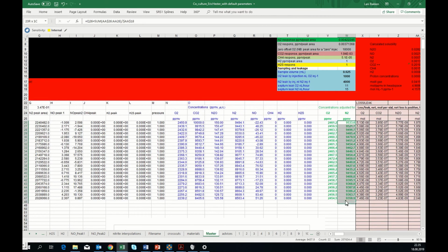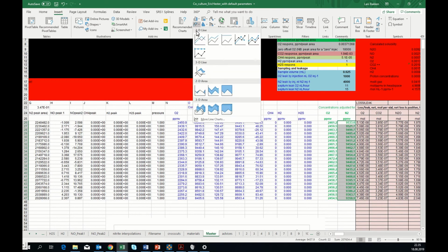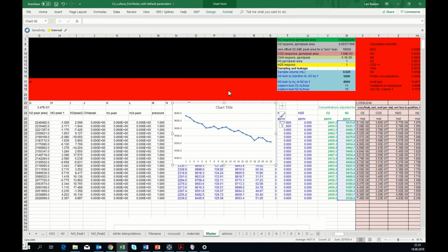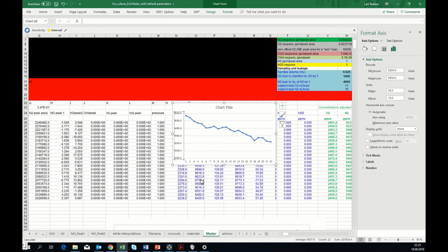Now you do the same exercise with nitrogen, and in theory nitrogen leakage should be 3 point something times the oxygen, but you can't trust that, because if your leakage is through polymers, the oxygen diffuses faster than nitrogen, so it's not necessarily the same relationship between nitrogen and oxygen in the leakage as you have in air.